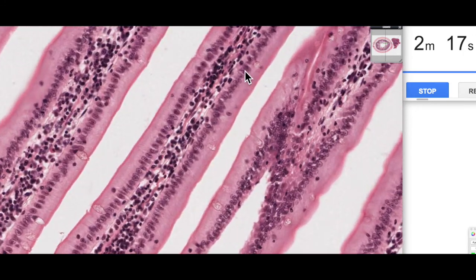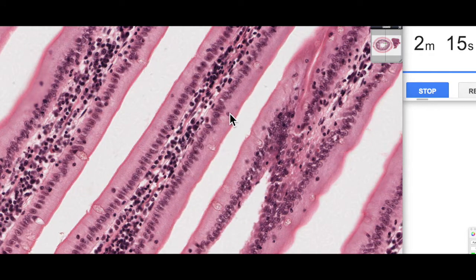We're zooming in here, this is a structure called a villus. It's a finger-like projection of epithelial cells. This is a simple columnar epithelium. You can see all the nuclei lined up like soldiers in a row standing at attention.